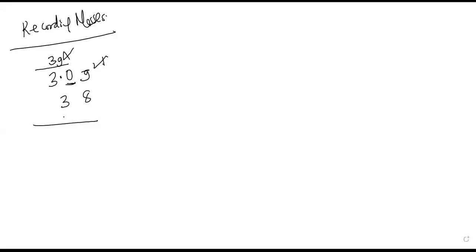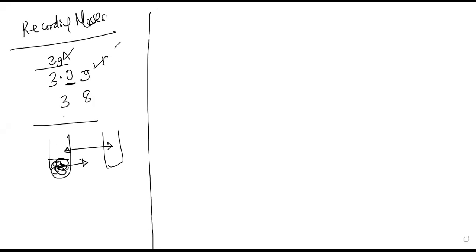Of course, the mass of the empty beaker should always be less than that of the beaker plus the solid sample. You can't put a solid sample in a beaker and tell me that together they have a lower mass than when the beaker was empty. Sometimes students write things because they are chasing time, and we also give marks because we are chasing time. So you have to be accurately sure of the apparatus you are using. When we go to one of the examples, I'll give you clear light about masses, okay?